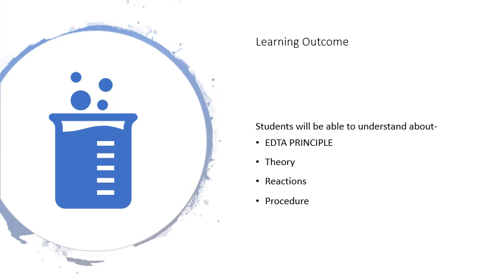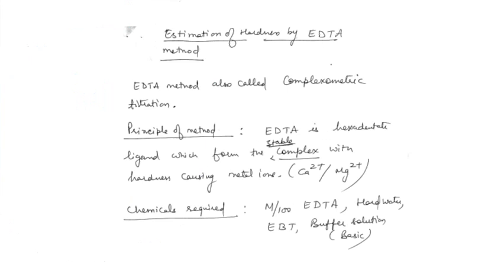The learning outcome of this lecture is that the students will be able to understand this method of estimation of the hardness, that is the EDTA method: what is its principle, theory, reactions and procedure. So let's start the estimation of the hardness by this EDTA method.